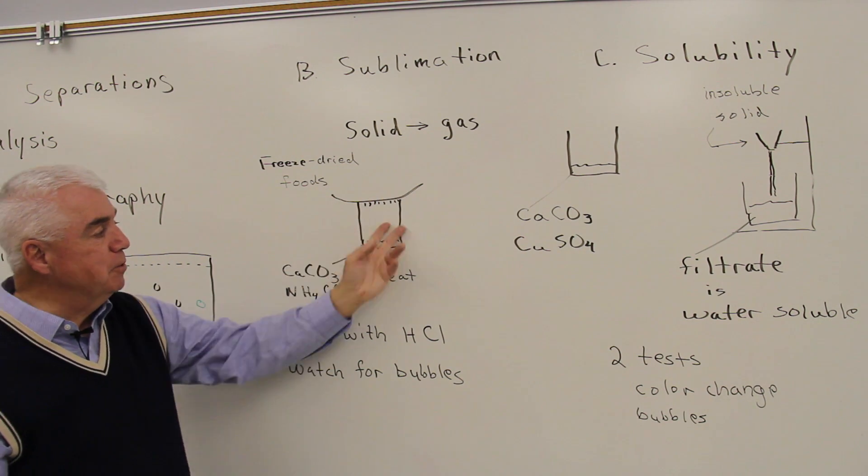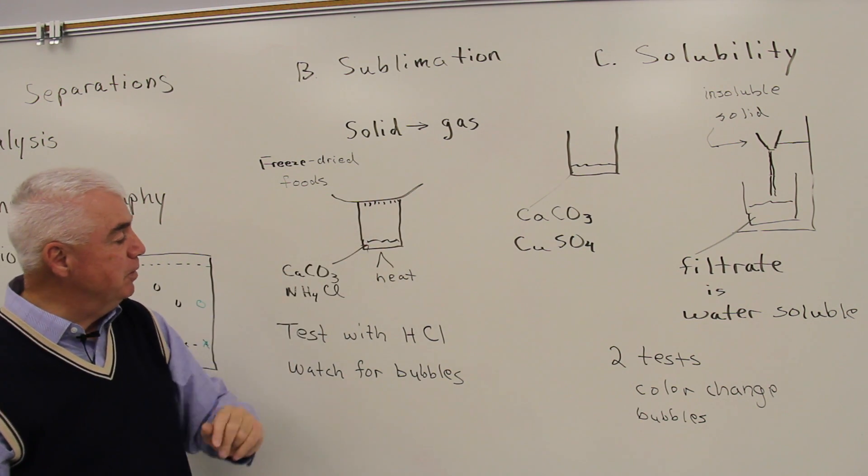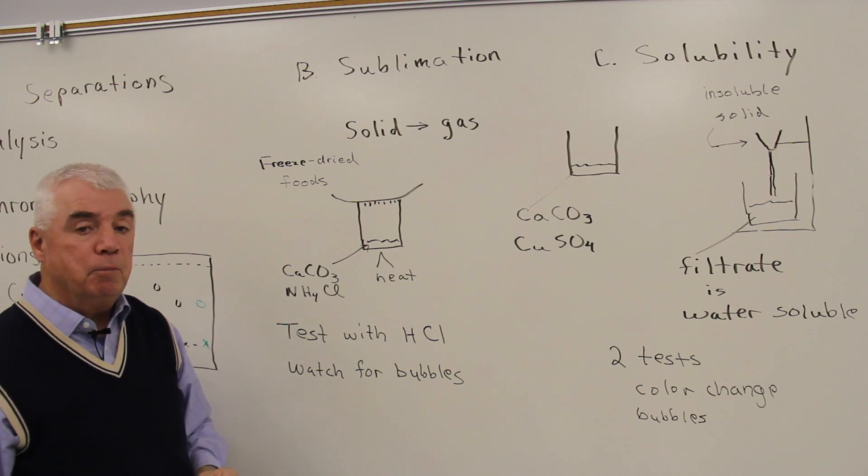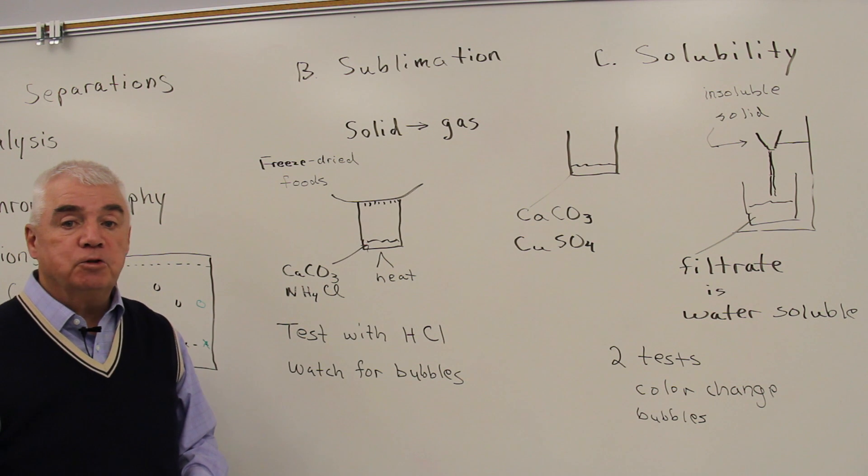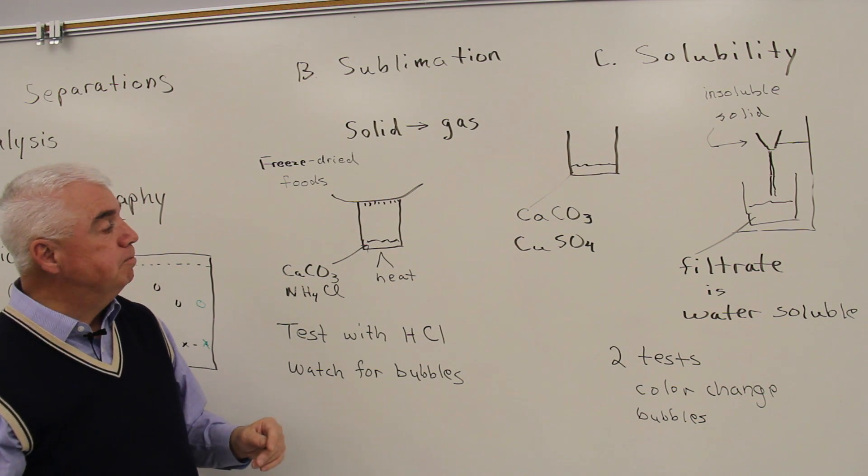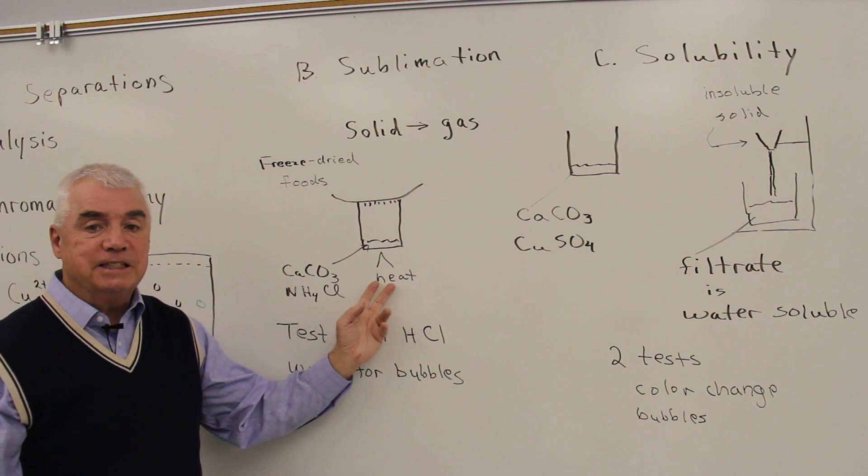Well, in this experiment, here's a beaker. Down at the bottom of the beaker, calcium carbonate and ammonium chloride. Up at the top, we've got some sort of surface that's a little cooler, and we'll apply heat to this mixture.